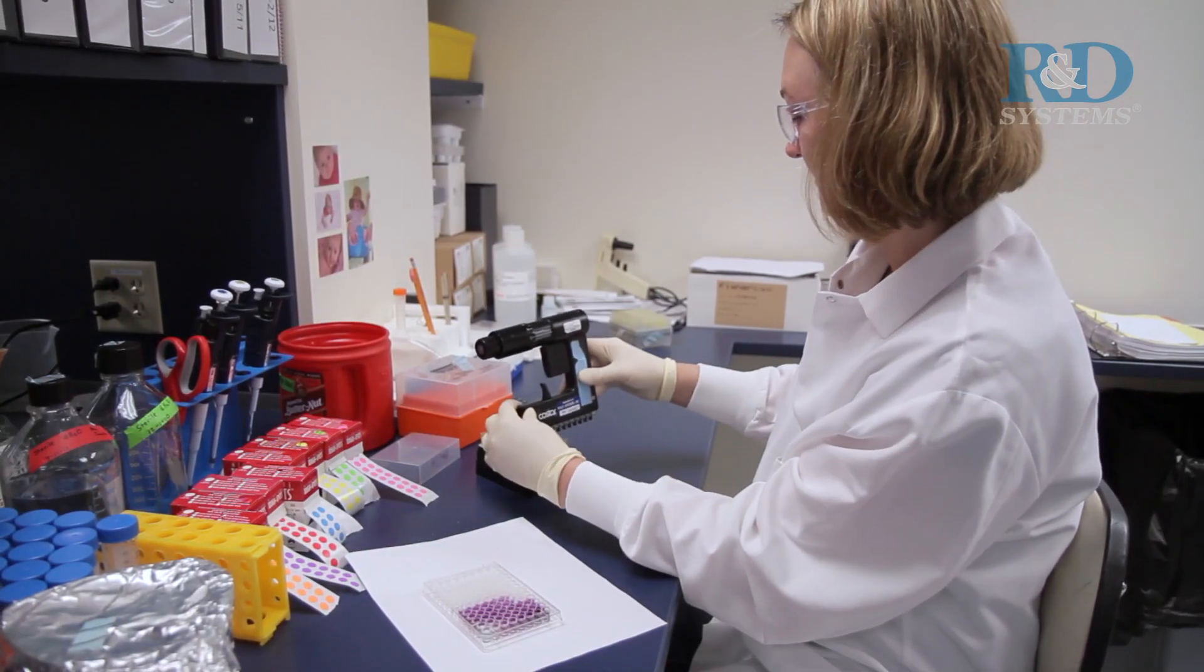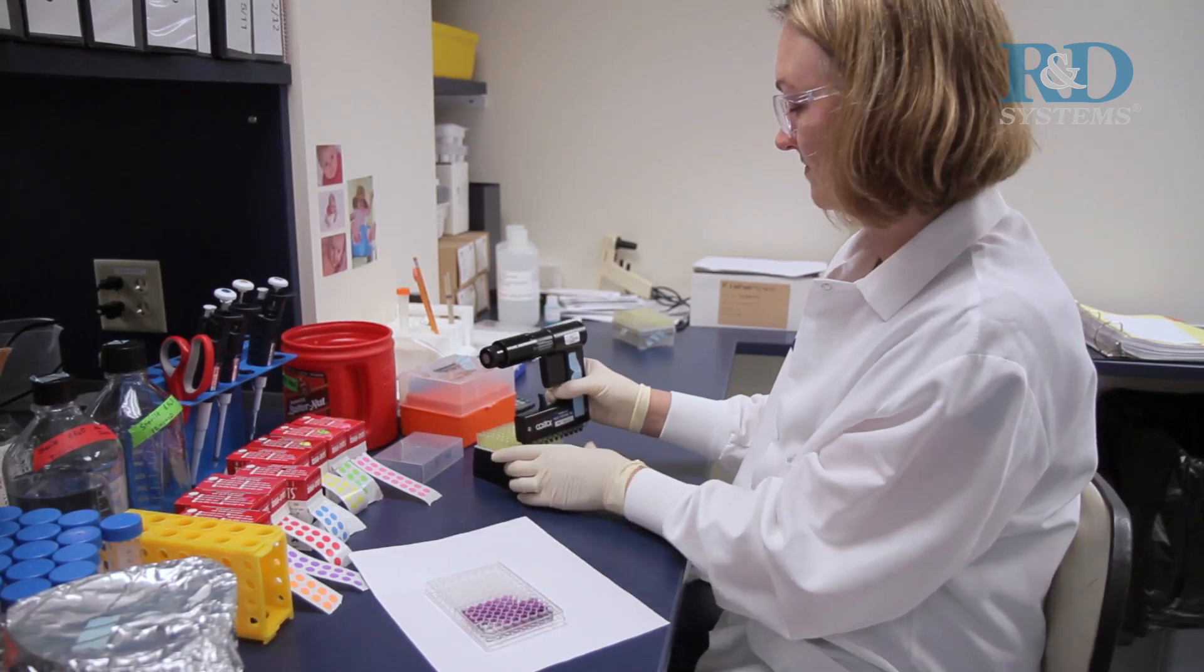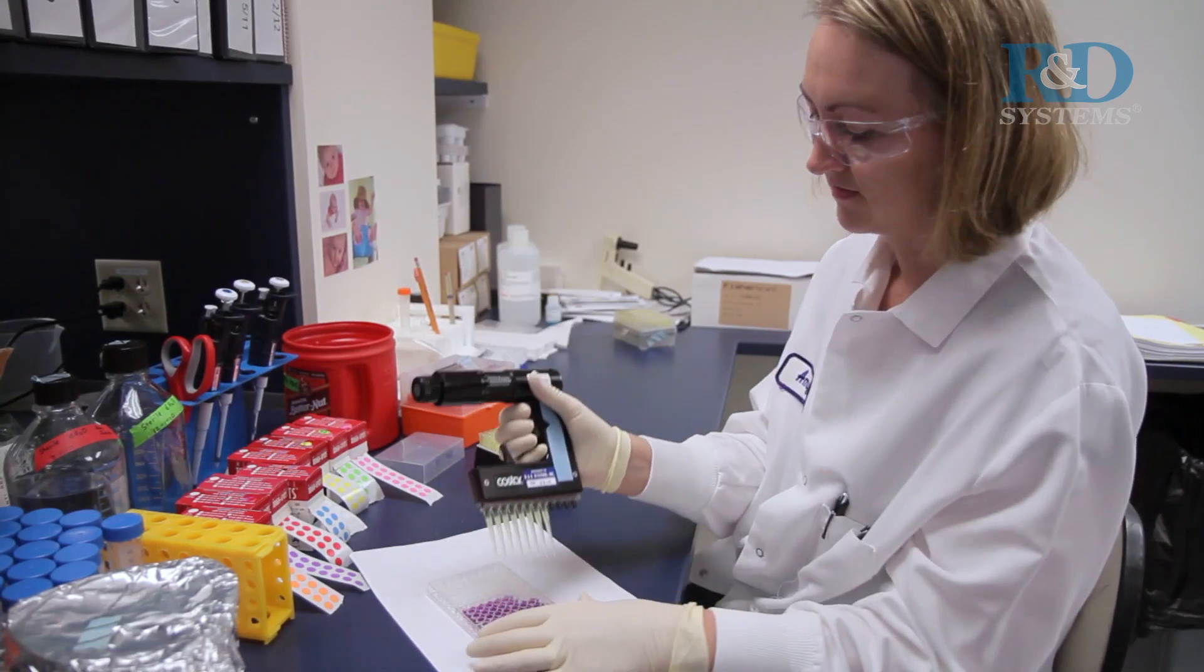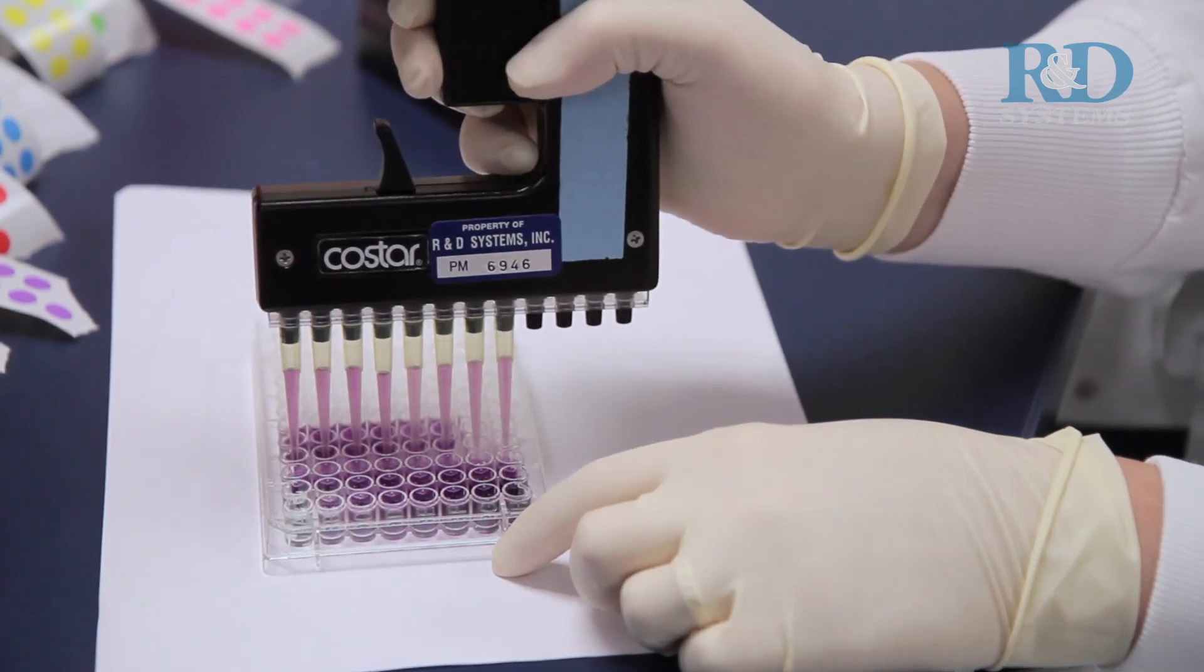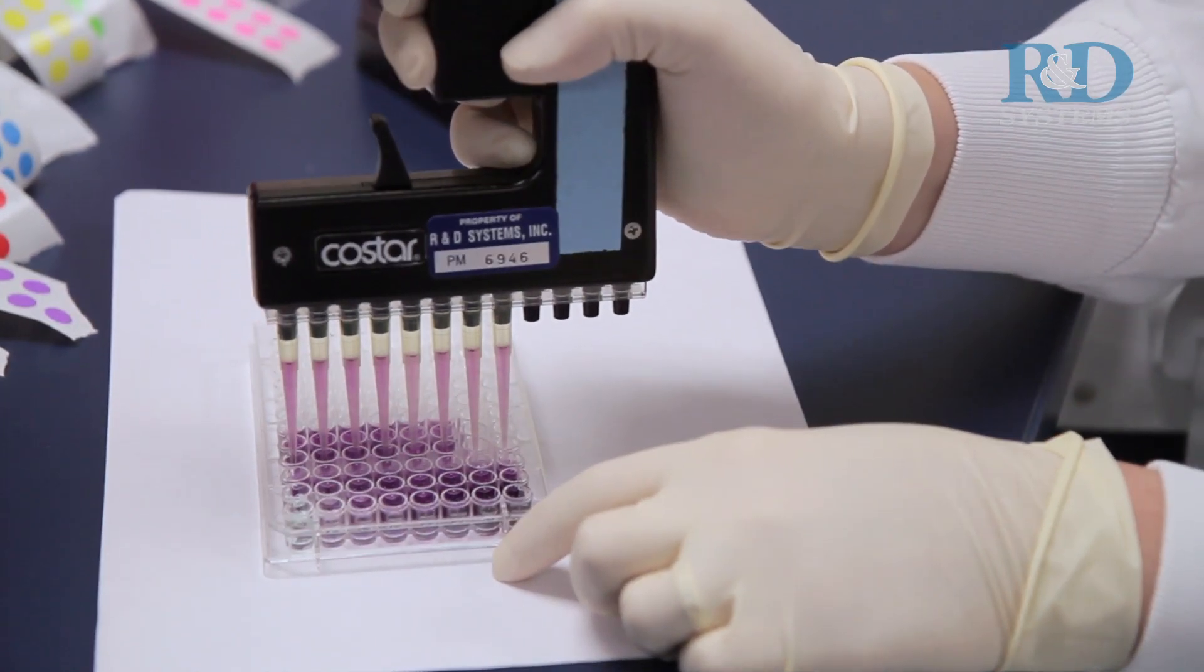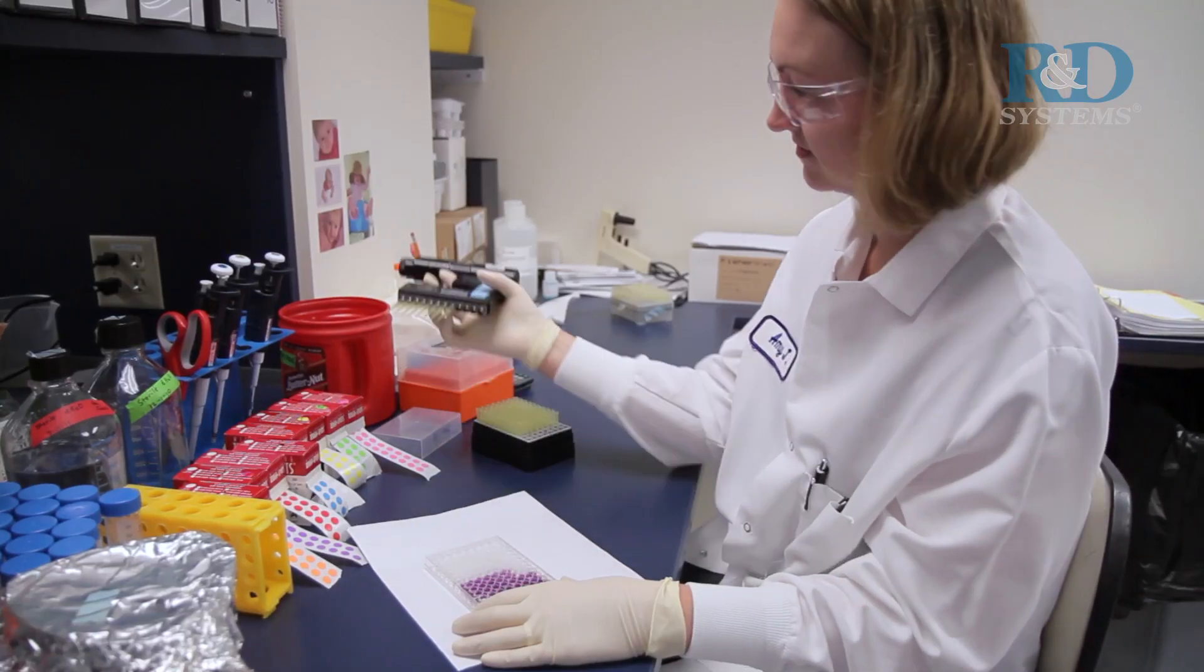Lysate concentration should be measured using a bicinchoninic acid assay. Lysate concentration may be empirically adjusted for optimal sensitivity and low background. A range of 100 to 300 micrograms of lysate is recommended as an initial starting point.